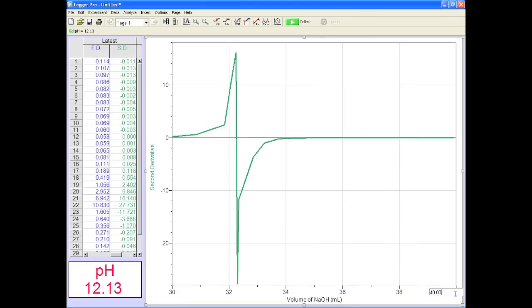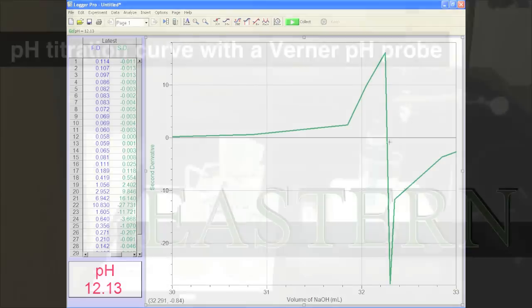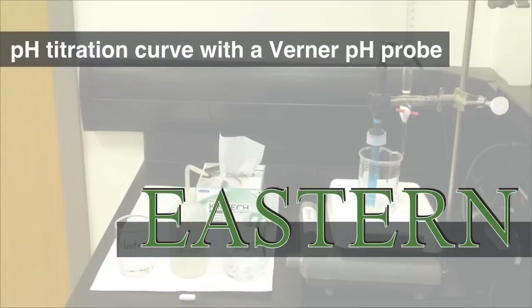Clean up and be sure to rinse the probe and put the probe back in the storage buffer. Now you know how to create a titration curve using a Vernier pH probe.